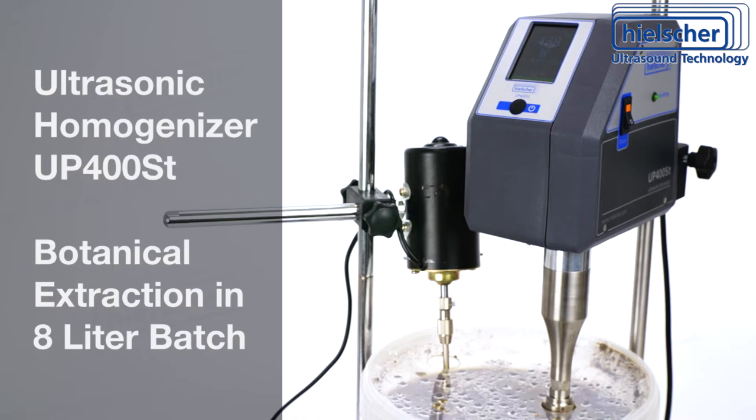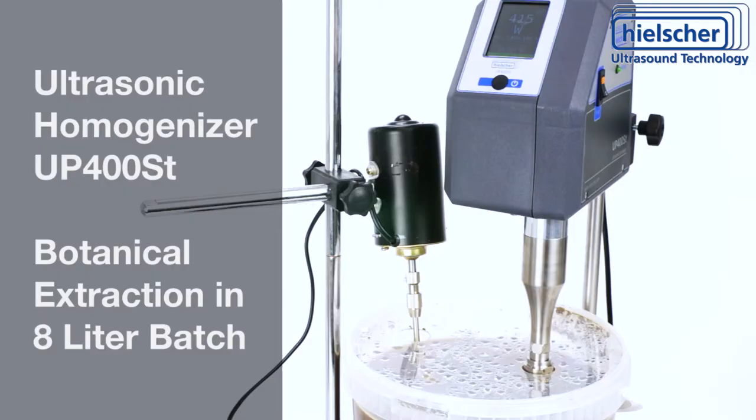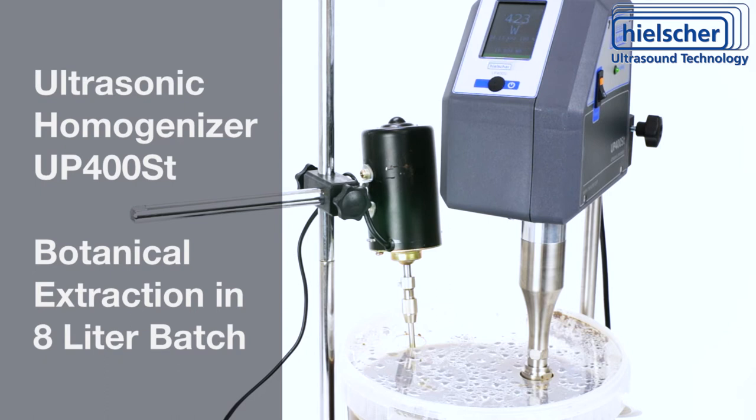In general, the extraction process takes only a couple of minutes. The UP400ST can operate continuously at full power — you can process batch after batch all day long. This gives you good processing capacity for such a simple setup.